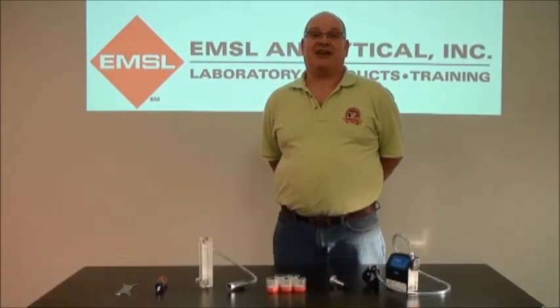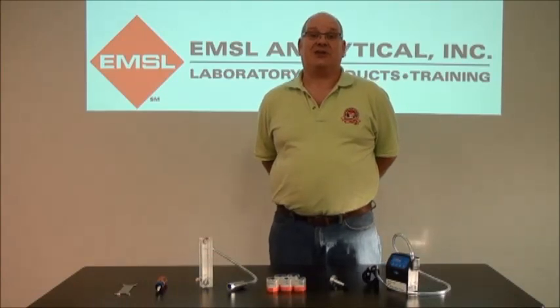Hi, this is Vince D'Alessio with EMSL Analytical. Today we're going to show you how to take respirable dust and respirable silica samples.